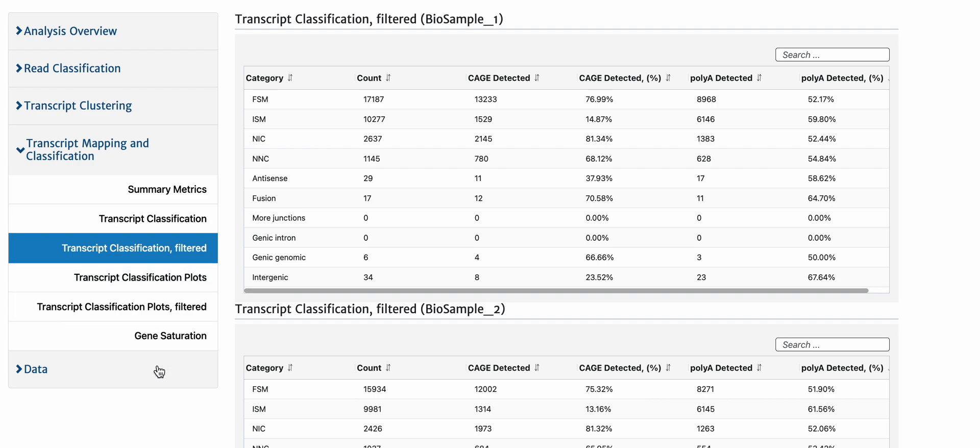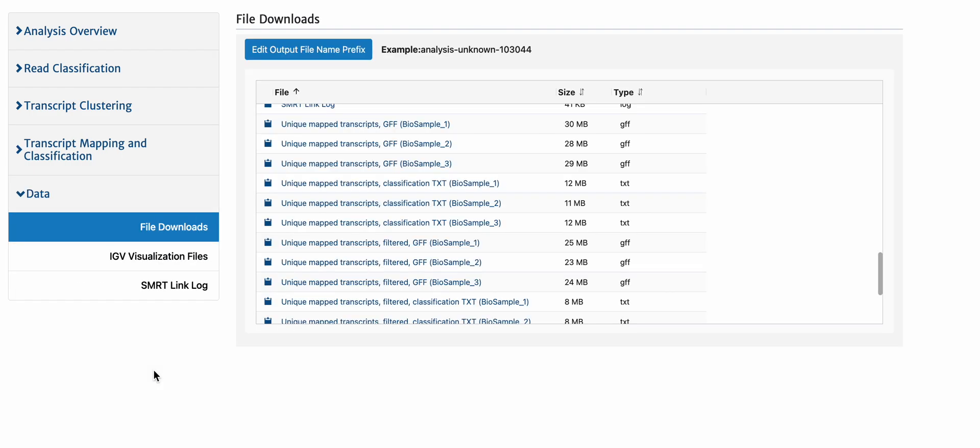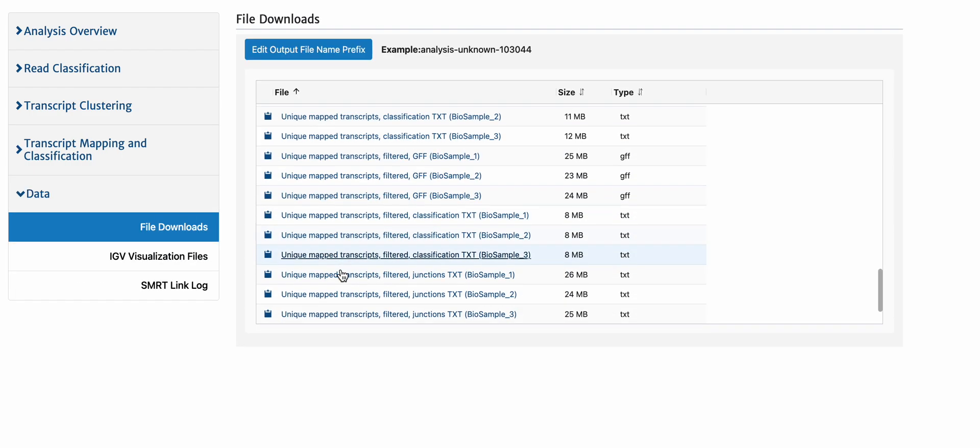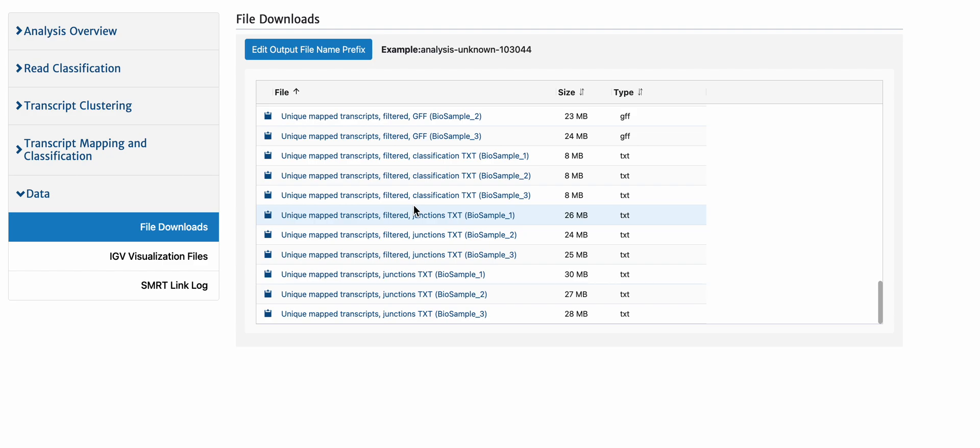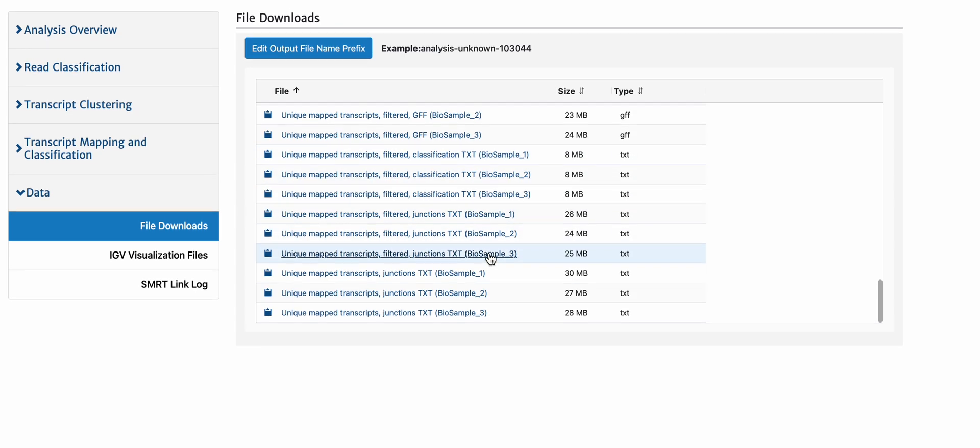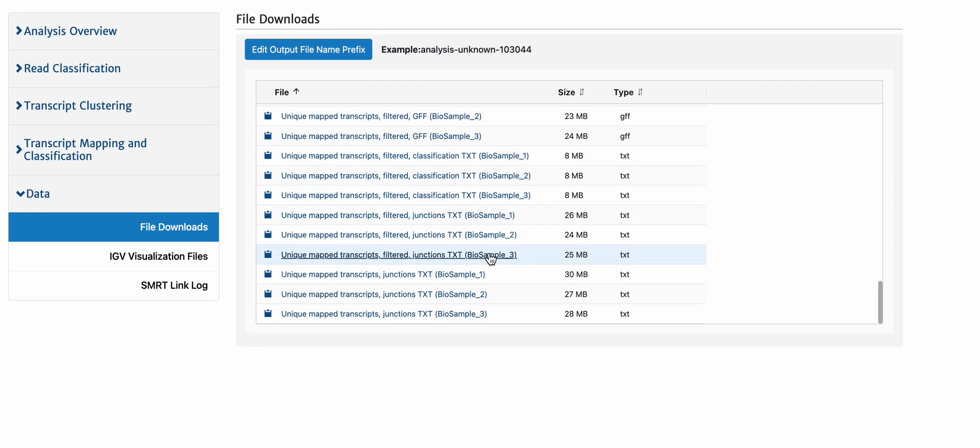If we go look at the data, the file downloads, we notice that a lot of the pigeon output results show biosample one, two, and three. That's because they were run completely separately.